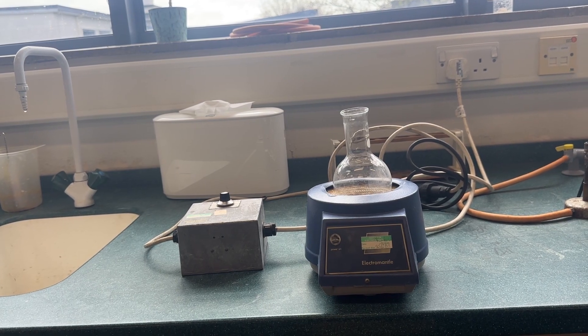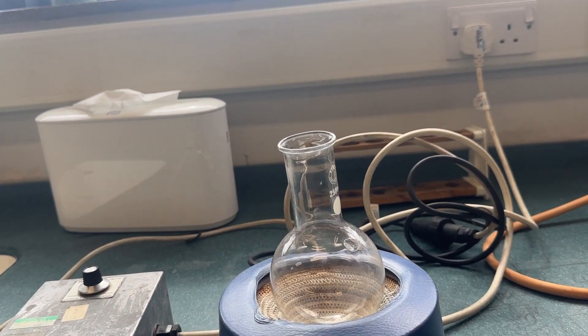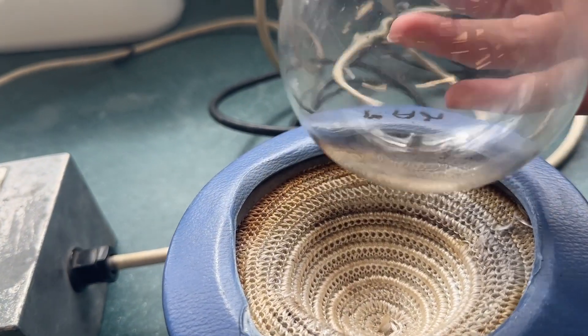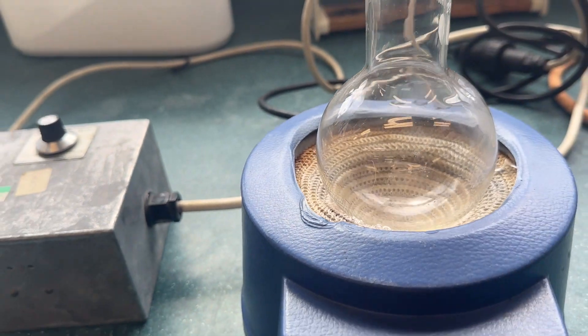Here we have an electric heating mantle. This is often used with round bottom flasks. You can see that inside we have a material which will heat up. There is an electric heating element underneath. It is shaped so that a round bottom flask can fit snugly inside.